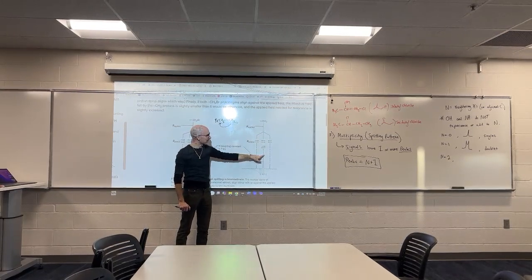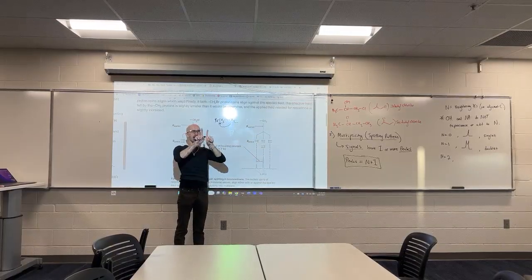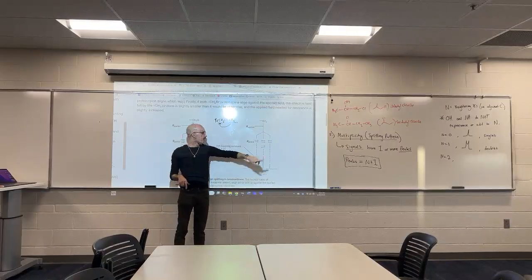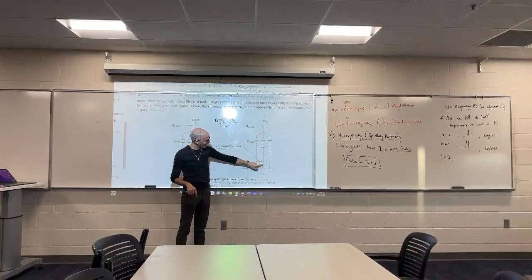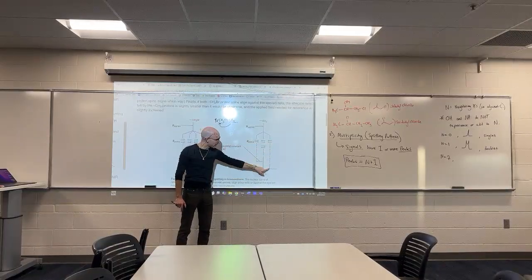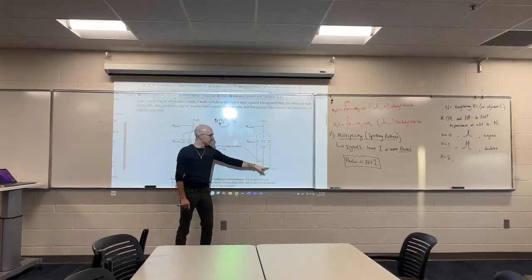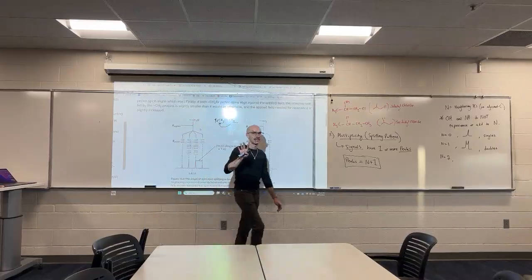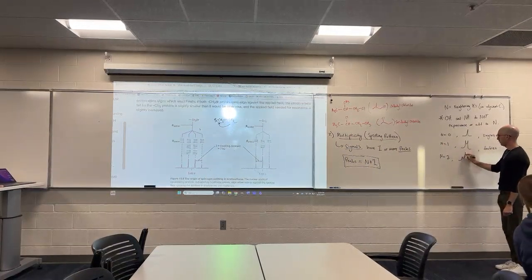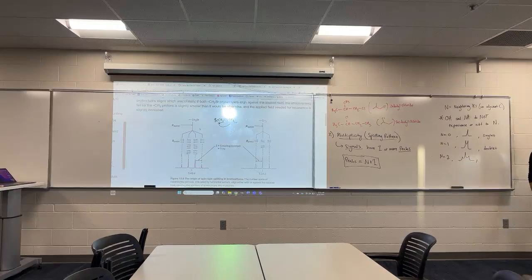We get a greater chance of the neighboring hydrogens being out of phase with each other, right? Out of alignment more often, and that impacts the shape of the signal more. In alignment, in different ways, having different impacts on your signal less often. So you do not get 3 equal peaks. Instead, you get a small, big, small peak, a little crown. And we call this a triplet.